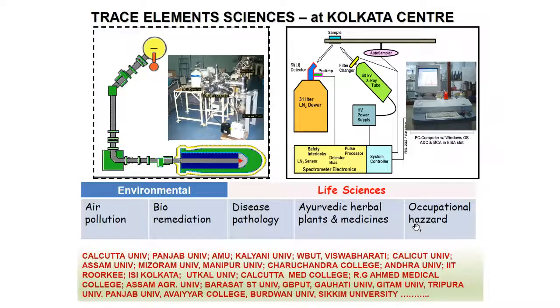So, as I said, we have a truly multidisciplinary facility when we try to look for trace elements of relevance for environmental, bio, anything, you name it, and the application is there. But as we decided that we need some home-based facility, here the excitation source is a lab source. Here is an accelerator, which gives me a 3 MV proton beam. These protons create a vacancy, which gets de-excited, resulting in the emission of an X-ray.